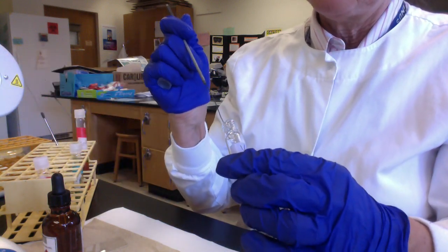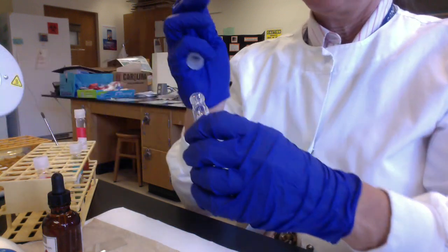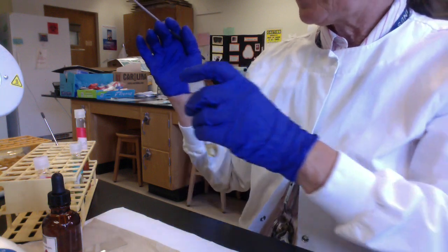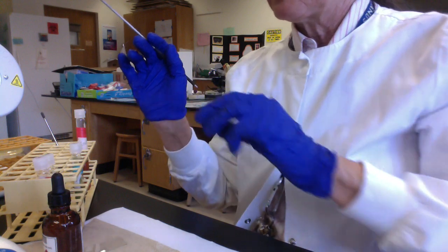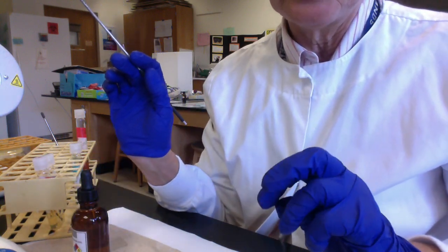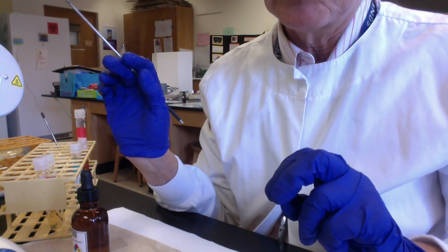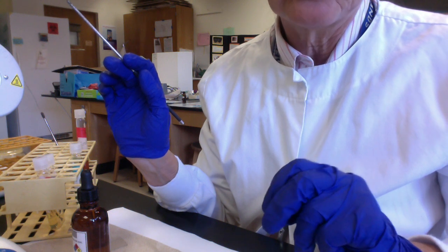Make sure I have a loose cap. Incubate 48 hours. And then after 48 hours, we're going to add 2 reagents, alpha naphthol and 40% potassium hydroxide. If our microbe uses butylene glycol fermentation, there'll be this unique intermediate called acetylmethylcarbinol produced, or acetoin. And when we add our alpha naphthol and 40% potassium hydroxide, we'll get a red color.